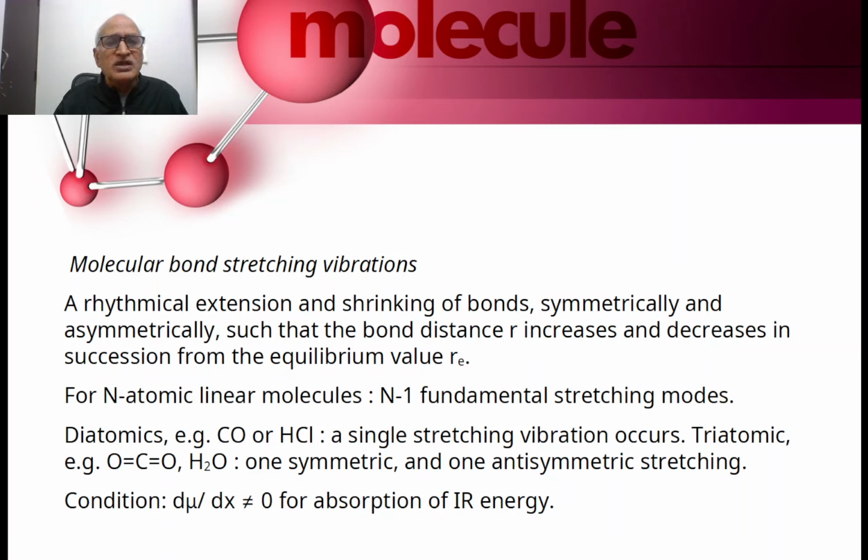Now, as I told earlier, molecules are continuously vibrating. Mainly, two types of vibrations are known. One is called bond stretching vibration, and the other one is called bond bending vibration. What is the meaning of bond stretching vibration? The rhythmical extension and shrinking of chemical bonds symmetrically or asymmetrically, such that bond distance R increases and decreases in succession from the equilibrium value Re.